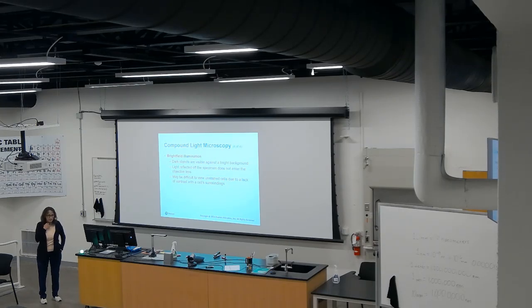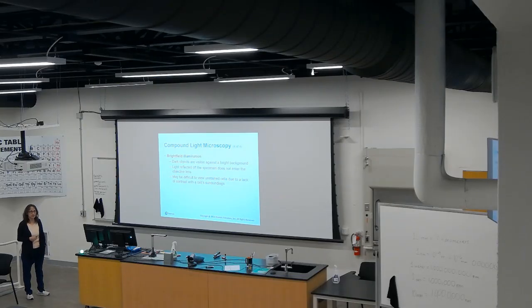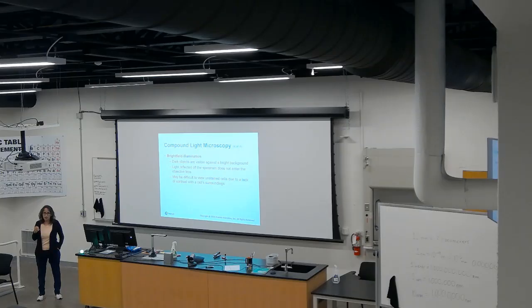So now for bright field illumination. Bright field microscopes, like the microscope that we use, allow you to see a dark object against a light background. And that dark object is actually not going to be naturally dark, when it comes to tissue or bacterial cells, unless this microorganism naturally has pigments.